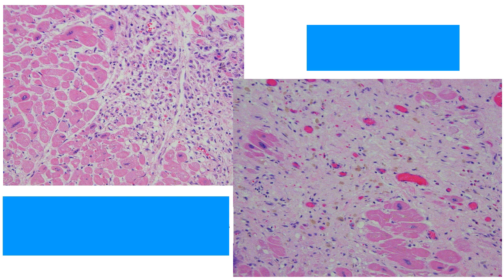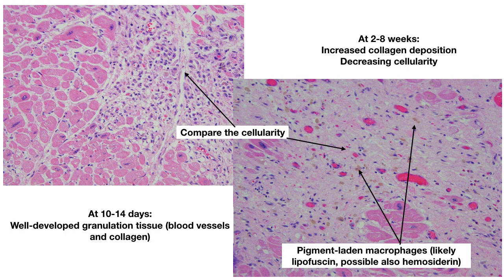What I want to do is compare the cellularity. At 10 to 14 days, you have well-developed granulation tissue with blood vessels and collagen. At 2 to 8 weeks, the collagen deposition increases and the cellularity decreases. Looking at the top left, there are a lot more cells than the bottom right, so the bottom right would be older. You can still see some blood vessels and pigment-laden — likely lipofuscin-laden — macrophages, with some residual cellularity.